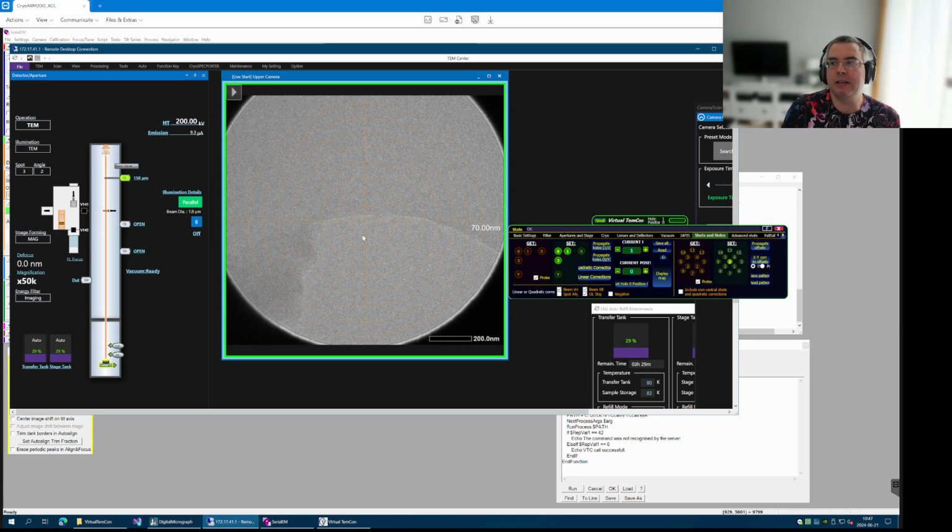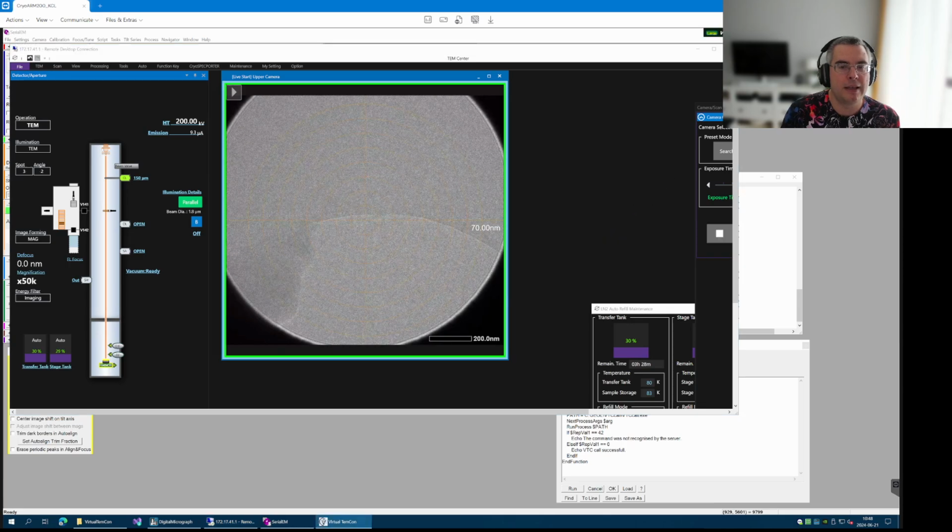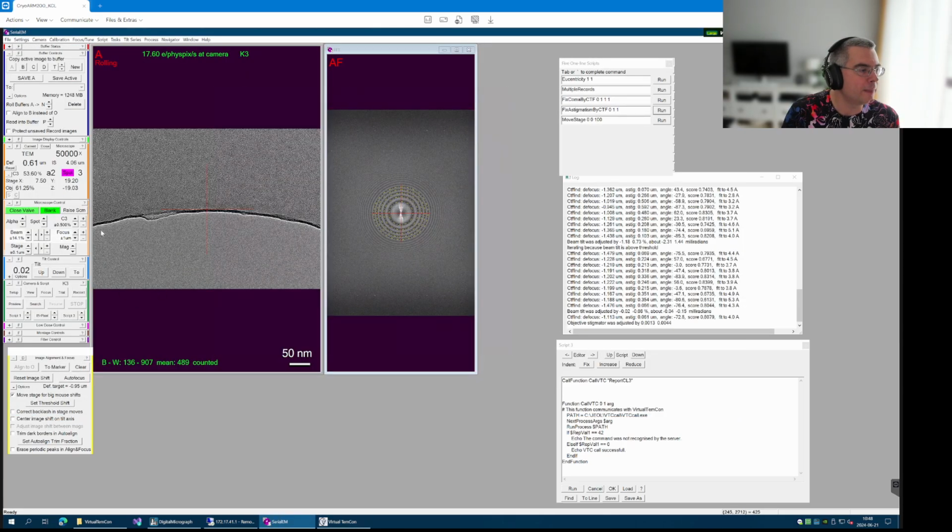It kept the magnification. So it applied image shift and beam shift, but it kept the magnification as it was. This allows you to position the holes in lower mags and then just work with them using higher mags. So this is our hole number 1, 4 microns image shift. Let's see how it looks. So let's take a record picture.